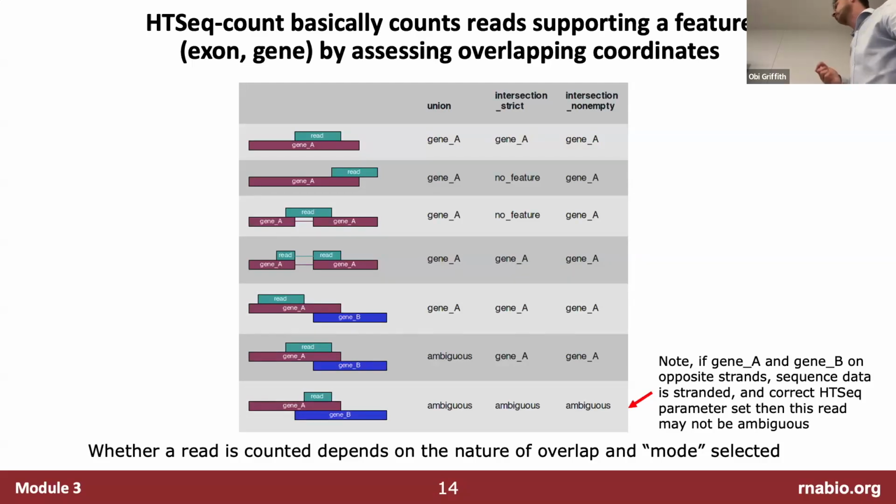I think it's a valid question. Let's say you have this read that supports gene A or B, but you have a lot of other reads all across the exons of gene A that support gene A as being highly expressed. And you have barely any reads supporting gene B in any of the exons or exon-exon junctions.